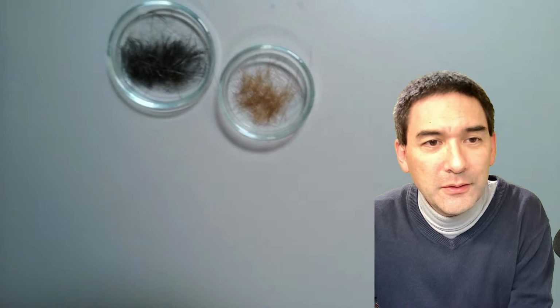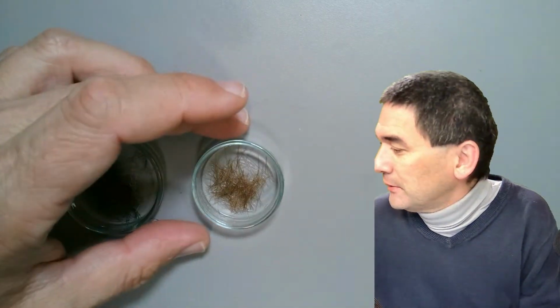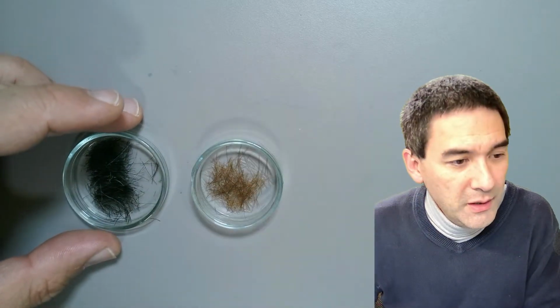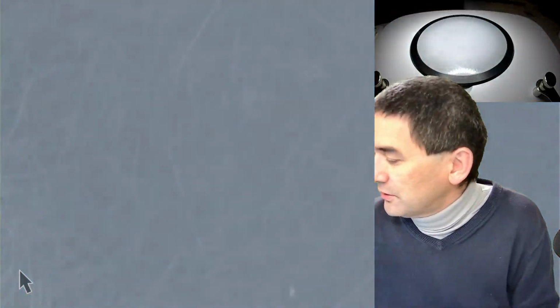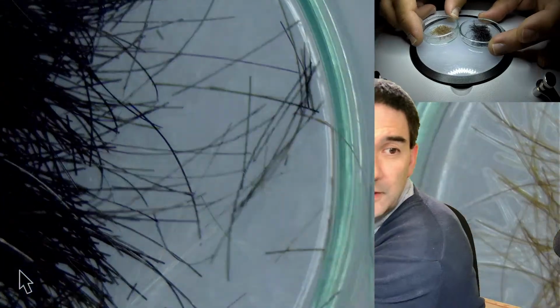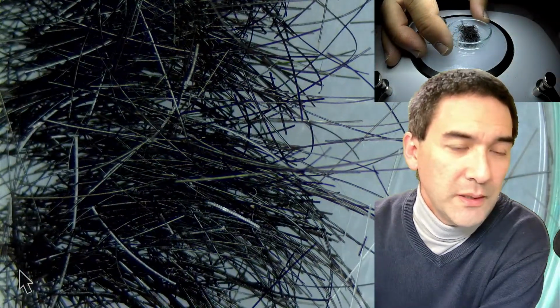Let's move it down here. And you know what? Not only here. Why not just put it under the stereo microscope? I'm gonna tell you I've done something to the hair to make it brighter. Here we go. No, that's the one here. So let's turn this around here. Here we go. So let's go up. This is already the lowest magnification that we can have.